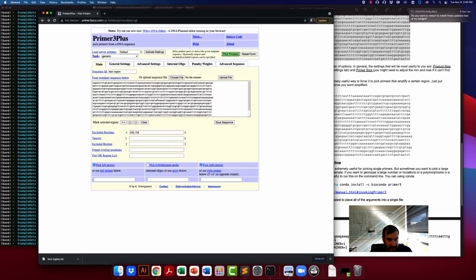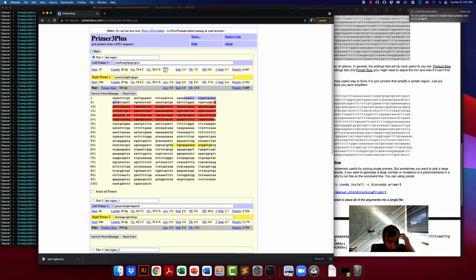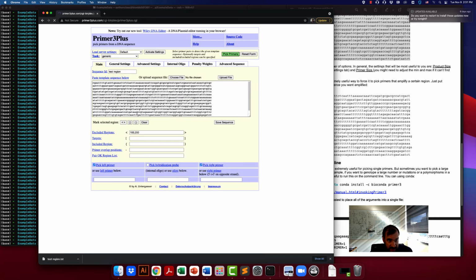And we can do this either by using these brackets that we put into the sequence, or you could specify by using this syntax where the first is the position and then the second is the number of nucleotides to exclude. So starting from position 100, and then the next 200 bases are excluded. So there's basically two ways we can use this excluded region.